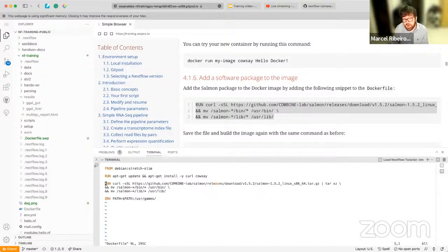I mean, it's not only going to be larger, but the way Docker works may be a bit slower because it's going to download per layer. If you change one layer, even a tiny thing, it's going to download the whole layer again. So you have to think wisely if you want to have one run expression with a lot of things or many different runs.